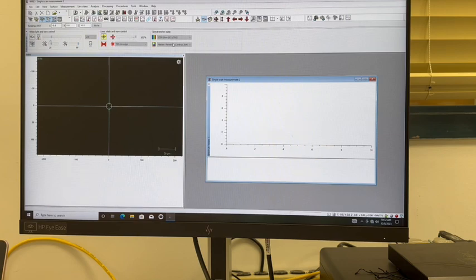Certain materials cannot withstand 100% laser power, so it is beneficial to start at around 1% laser power and work your way up, checking each time to ensure that the material has not burned.